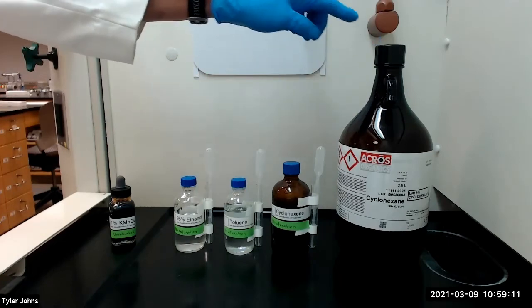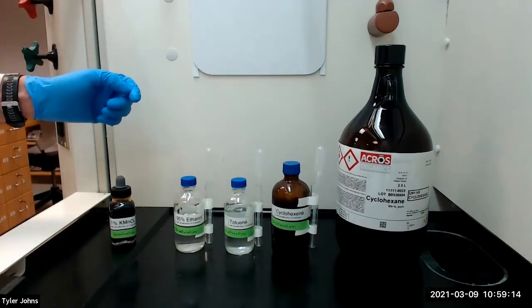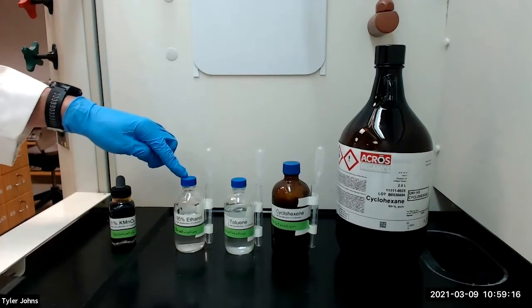We will add two drops of each of the known compounds to three separate test tubes, and then add two milliliters of 95% ethanol to each test tube.